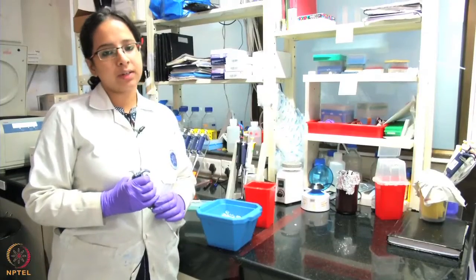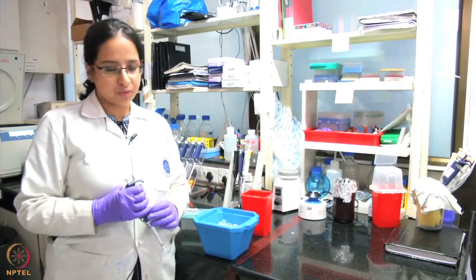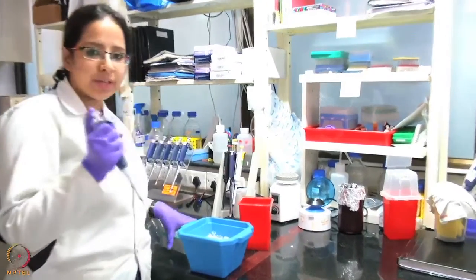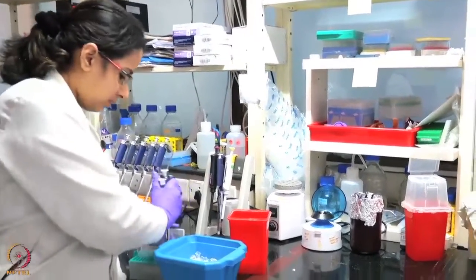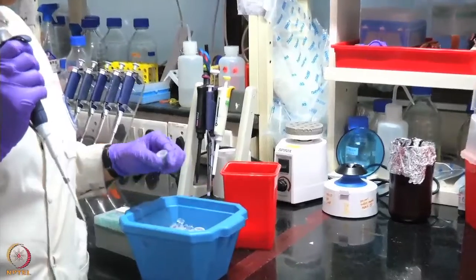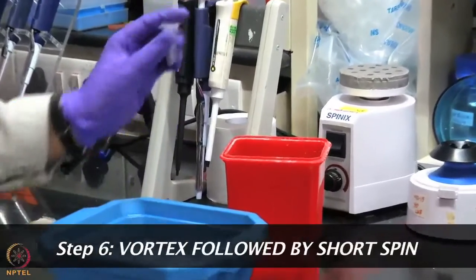Once we've added vector as well as insert, we'll add ligation buffer. Before adding anything, we just need to pipette it a little, mix it a little bit. So this is the ligation buffer. I'll give it a small vortex.